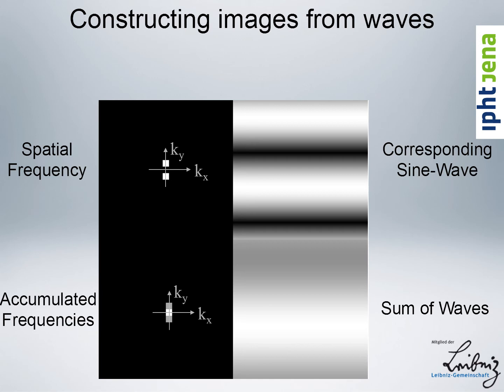So if this was the first, really the lowest frequency that we can represent, being 1 pixel here, well, first of all, because the Fourier transform is a complex valued thing and we have real valued images, we always get actually 2 frequencies, one at plus k and one at minus k. Because if you have e to the ikx plus e to the minus ikx, divided by 2, you're getting a cosine wave like you would be getting here. And then depending on what phase they really have, you can shift this wave around. So that's represented here. What you might notice, if you're looking closely, is that this is not 1 oscillation as you would expect, but it looks like 2 oscillations.